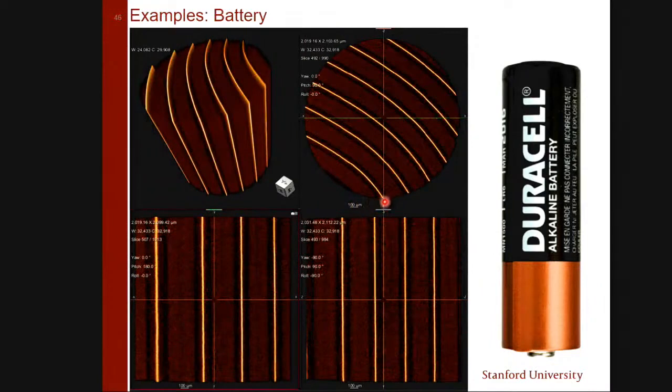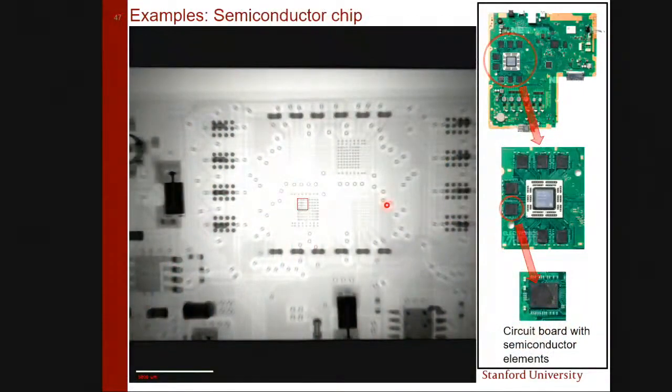Here you see different parts, like the cathode, anode, electrode, and this is all rolled. And you can investigate now what is happening, okay? So this is done continuously in our lab by battery research people. If they have these kind of batteries, they would investigate them. And they do cycle them as well, till they fail.